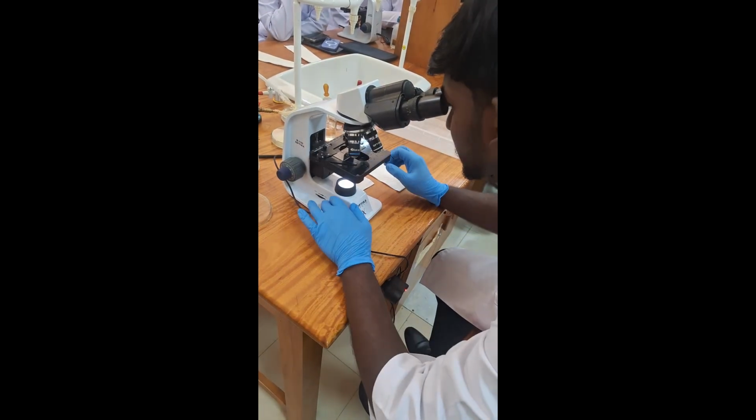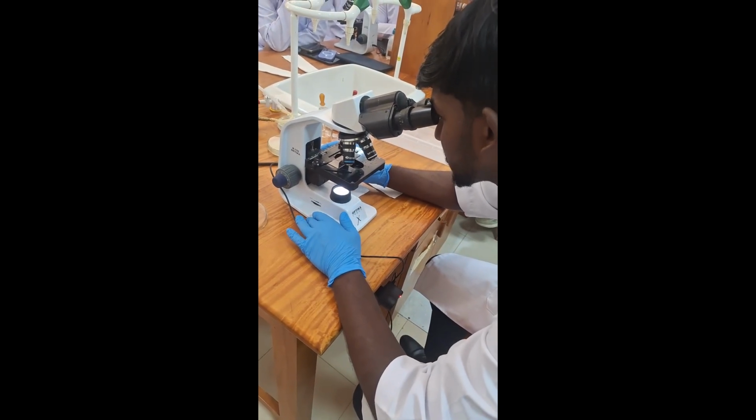Gram-positive bacteria appear purple. Gram-negative bacteria appear pink.